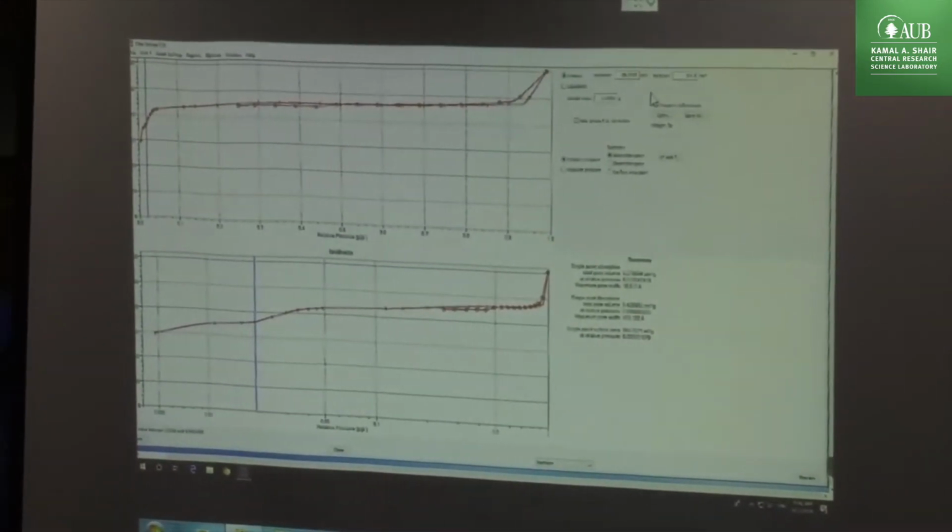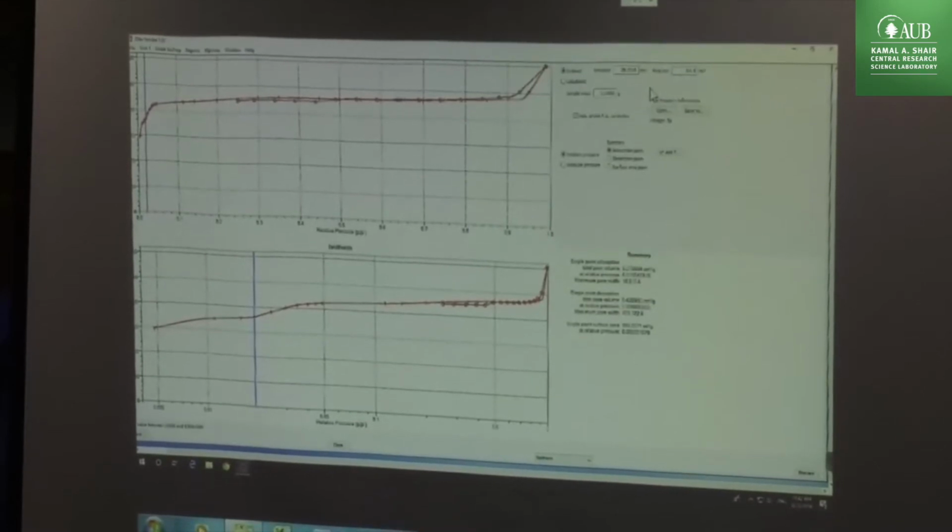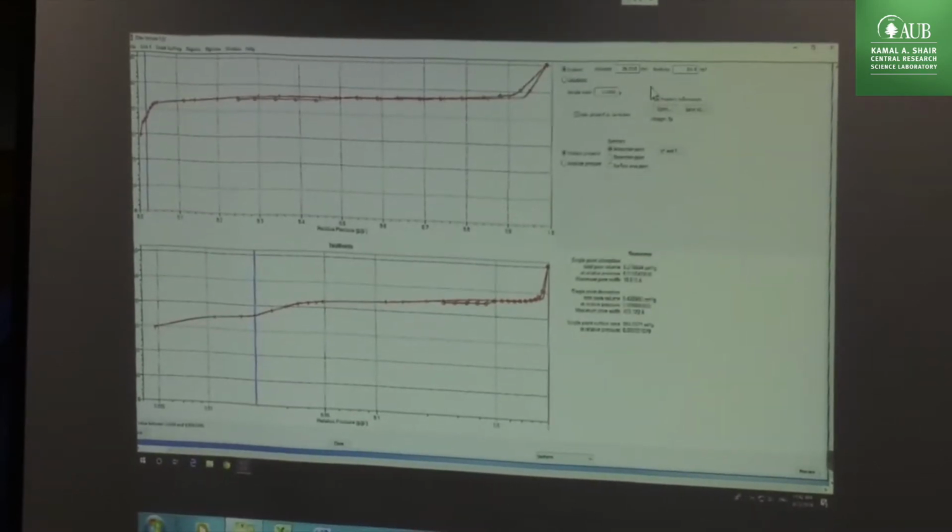Anyway, so this is the result. The second thing is that we need to have the weight. This morning he was upset because we saw the sample BET surface area was 0.6 or something like that. Remember, the specific surface area is the area divided by the sample weight. So the sample weight should be taken after analysis. Why?